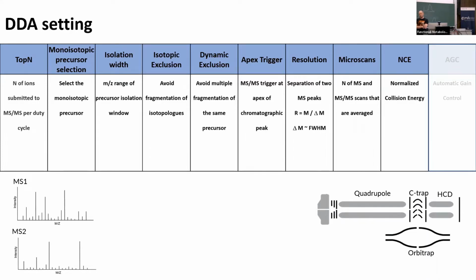I agree. The trade-off is again speed, right? If I get 3 single MS events at 3 collision energies, I need to use 3 scans. If I do it stepped, then it's only 1 scan. So I have 3 times more MS. Now, if I have a very simple sample, or let's say a natural product, I isolate it and I want to find out a lot about the structure, then I would for sure run it at separate, different collision energies, because I have the time to spare, right? Not in a non-targeted experiment of thousands of different compounds.